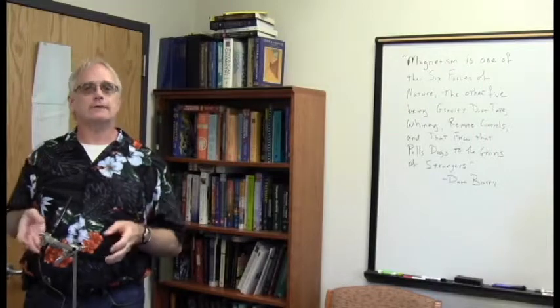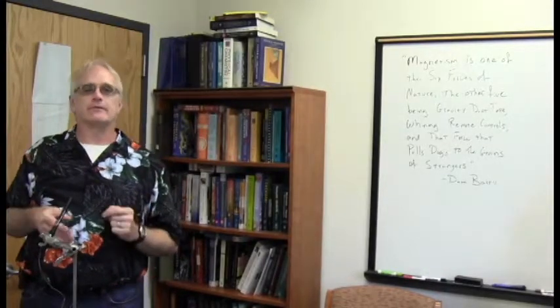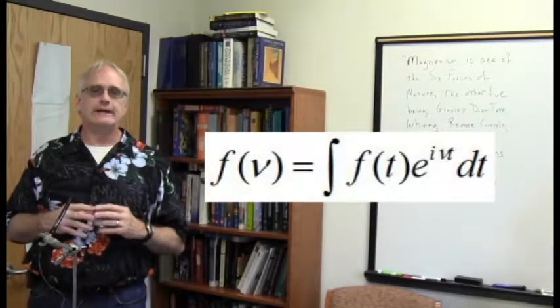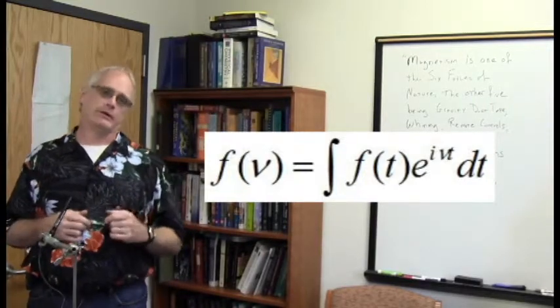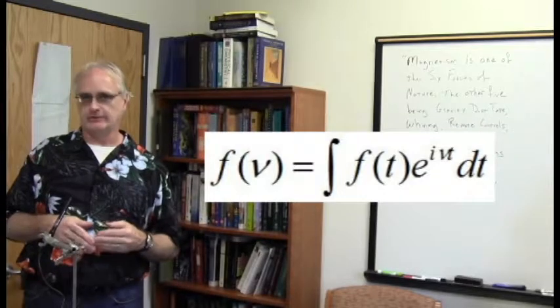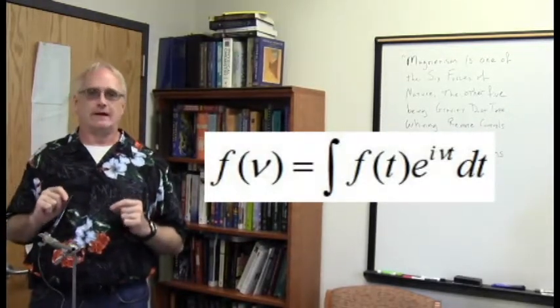First, a quick look at the equation for the Fourier transform. It's a pretty fearsome thing, and no, we are not going to do anything more than what our dear friends in the math department and the computer science department have built into the software we make use of. But what I want you to see from this is the following.